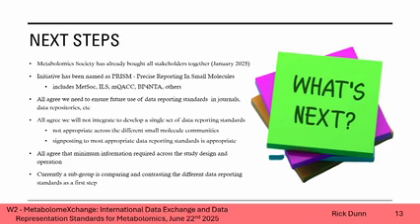So what are the next steps? Well, we already brought stakeholders together in January this year. We're naming this initiative PRISM. We've just had a vote across everybody that's involved. So this is Precise Reporting in Small Molecules. It will be called PRISM 26 or 27 when we finalise this, in case we do edits in the future.